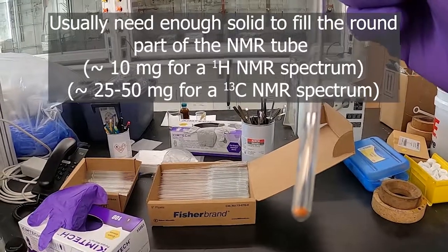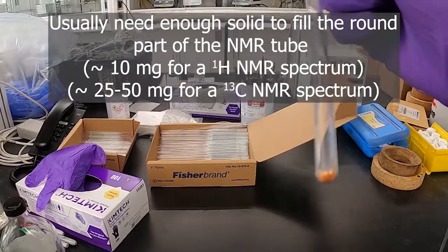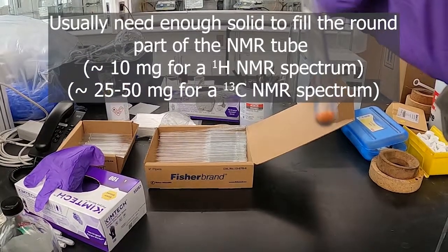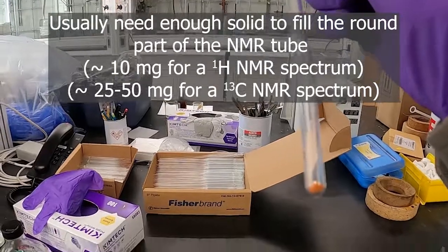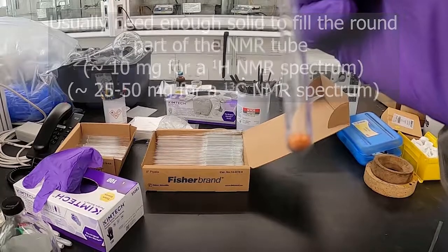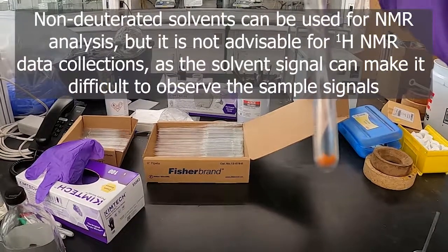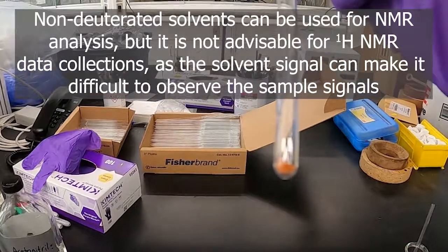So there we've got our tube. A rule of thumb is if you want a nice concentrated sample — say you're trying to get a carbon NMR — if you fill up the little dished, bowl portion of the bottom of the NMR tube, which this is pretty well doing, this would be enough sample for a really good carbon or proton. If you have a little bit less, you'd still be okay for a proton, but you want about this much — about two scoops with that little spatula would be plenty of sample.